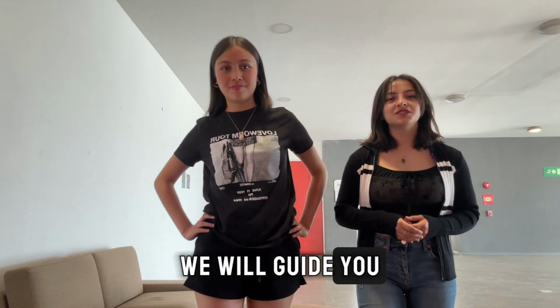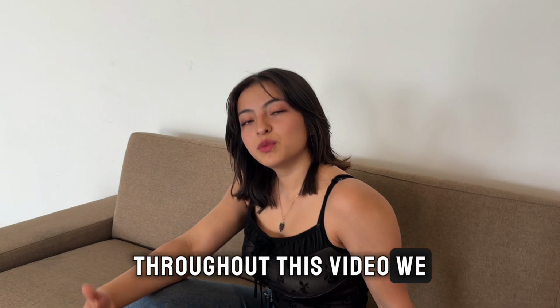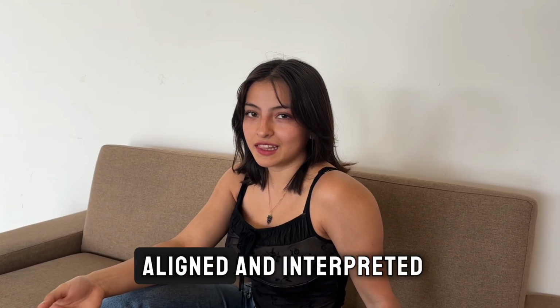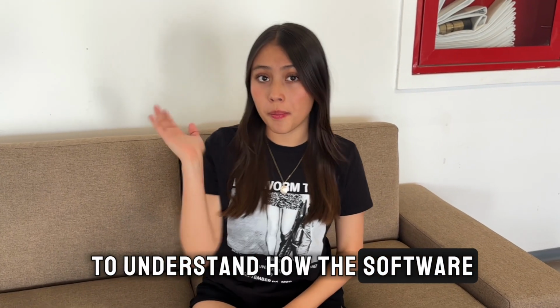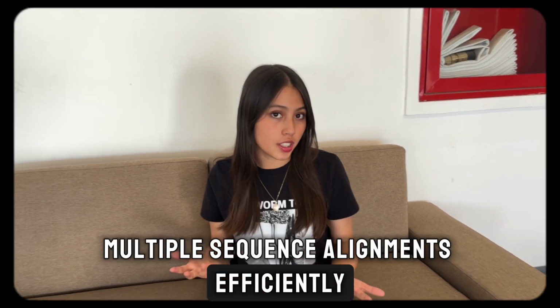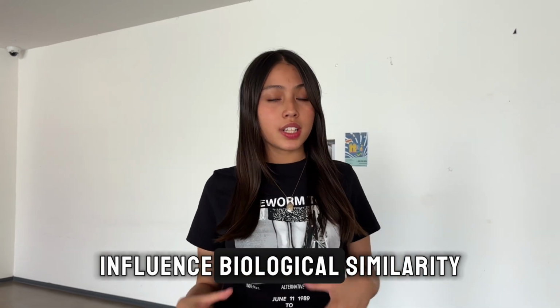And today we will guide you to the fascinating world of sequence alignment and phylogenetic analysis using cutting-edge computational tools. Throughout this video, we will explore how biological information like protein or DNA sequences can be compared, aligned, and interpreted. Using advanced mathematical concepts such as Fourier transforms, correlations, and convolution. Our main focus is to understand how the software MAFFT uses these techniques in order to perform multiple sequence alignments efficiently, and how underlying physical and chemical properties such as volume or polarity of amino acids influence biological similarity.